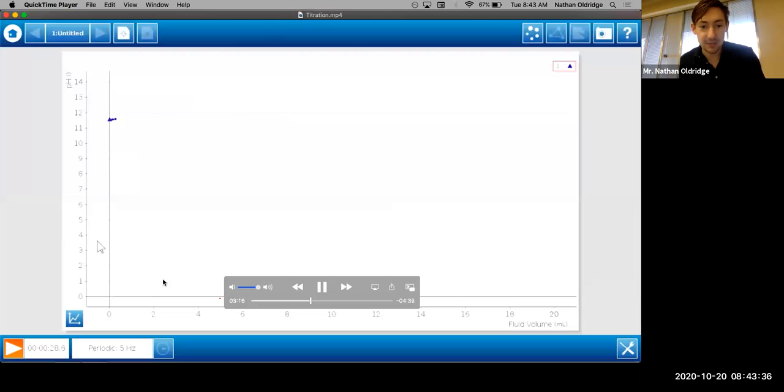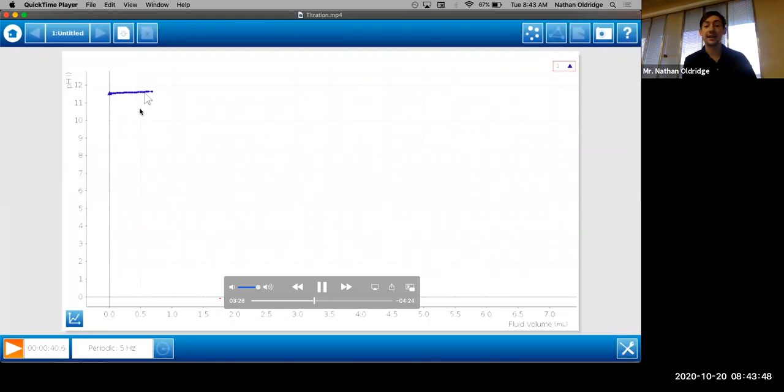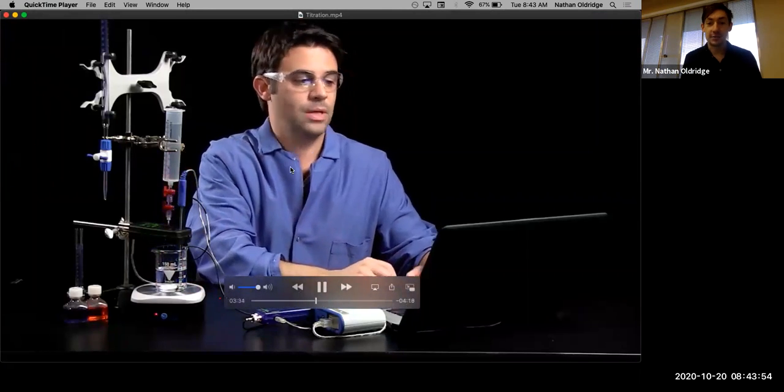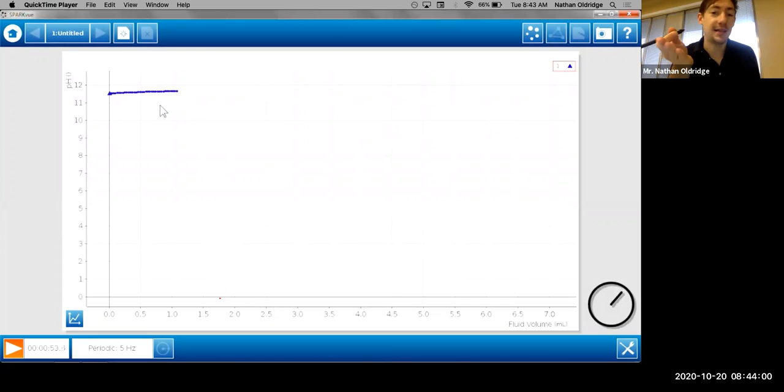Anyways, he is going to turn it on so that something is dripping inside. He's got a magnetic stir bar to make sure it's fully mixed all the time. And as we expected, the pH, the y-axis here is measuring pH, is about, I don't know, somewhere between 11 and 12. We could calculate what the concentration of the NaOH is from that, but we're not doing that right now. I just want to point out that he's adding HCl, and actually it looks to me like the pH is staying about the same.